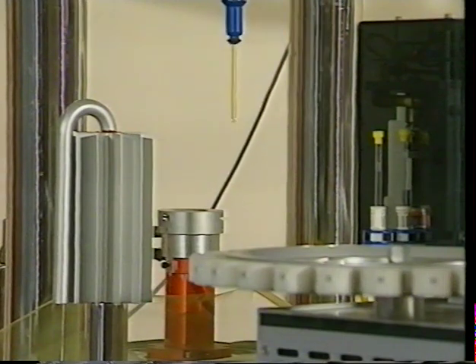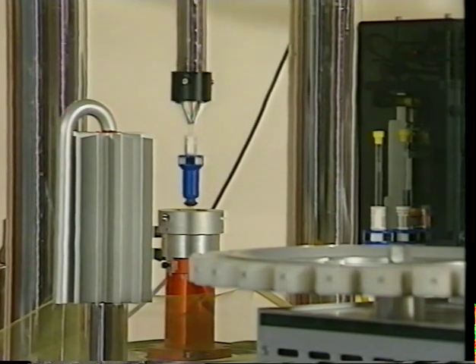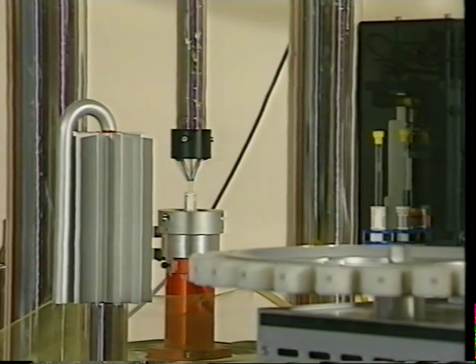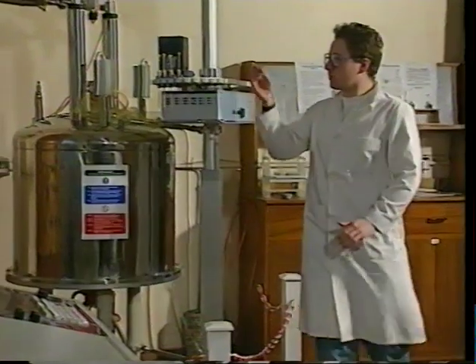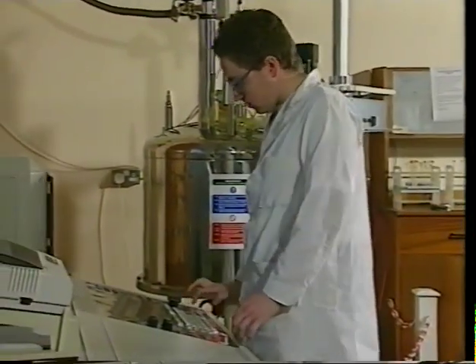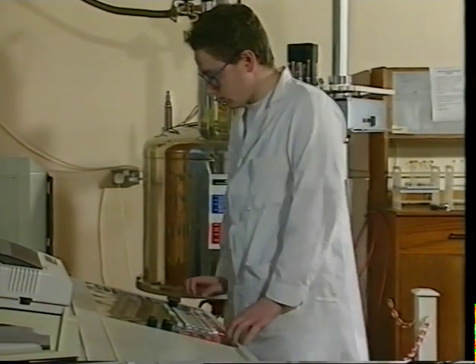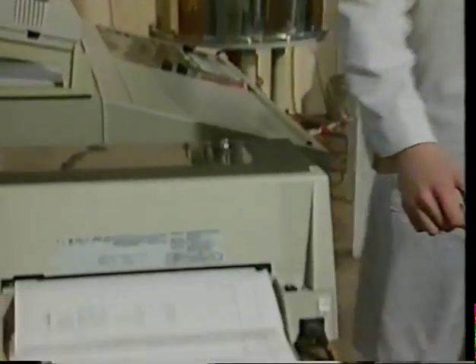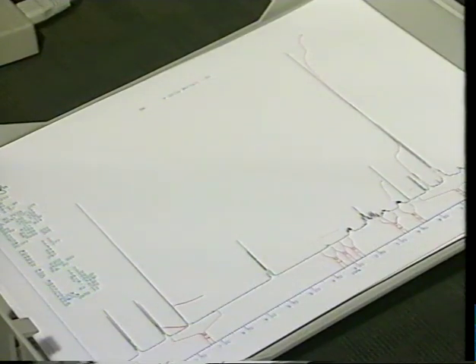We usually run an NMR spectrum to determine the structure of a molecule whose empirical formula we already know, normally obtained by also having a mass spectrum run on the compound. It's a non-destructive technique used extensively in chemistry to determine the detailed structure of unknown compounds. So, what exactly is nuclear magnetic resonance, and how does it identify molecular structures with such certainty? Just what can we learn from a spectrum like this?